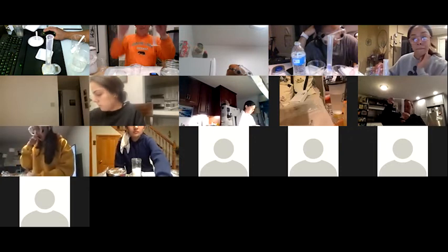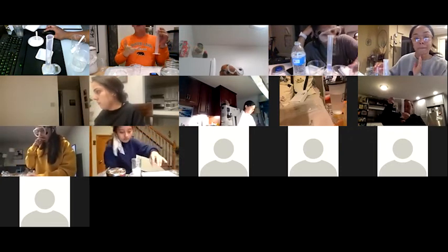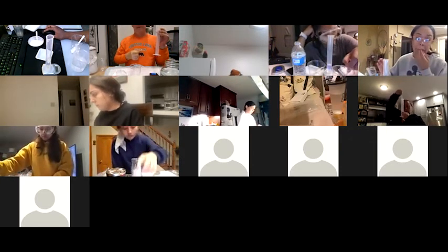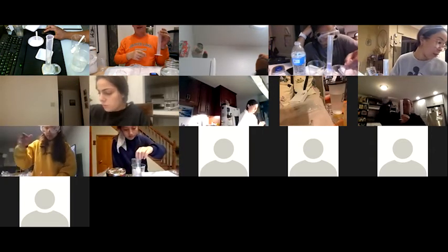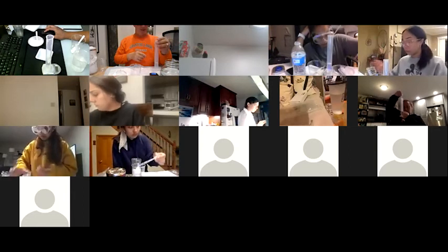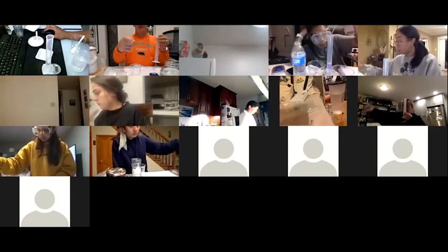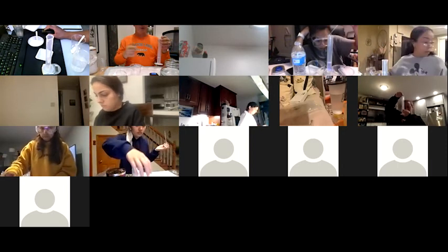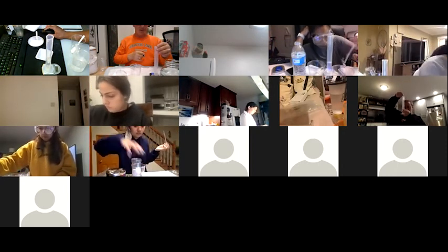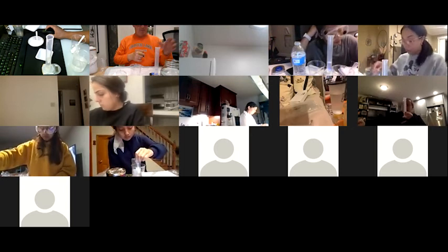So should I just stop the experiment, continue tomorrow and buy sugar? Yep. Well, have you finished the 10%? I did. Then I would do the calculations for your 10%. Measure the mass of 5 mils of it, 10, 15, 20, and 25. Same with the water. You should do that for the water as well. Thank you. No problem.